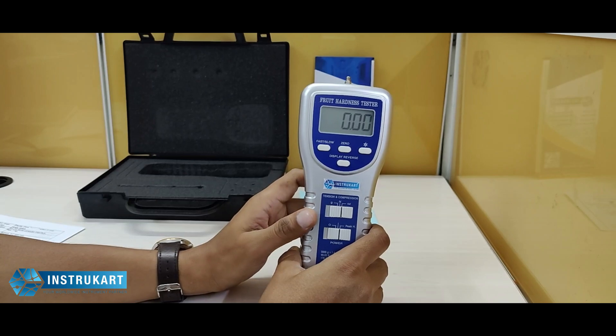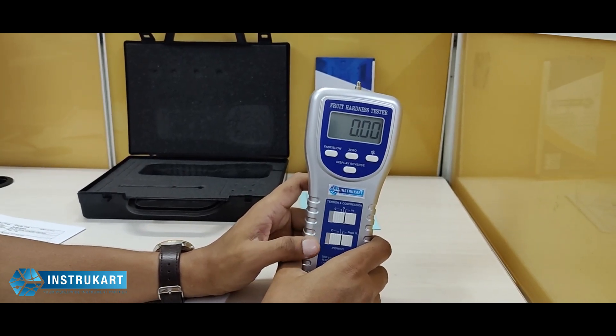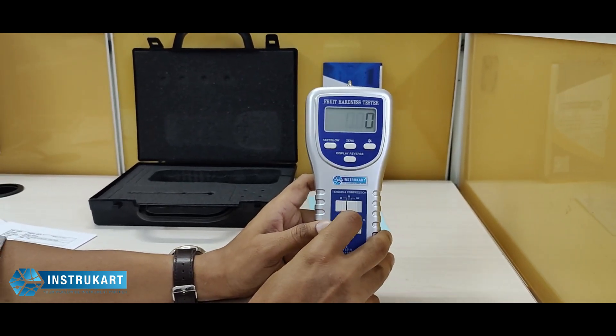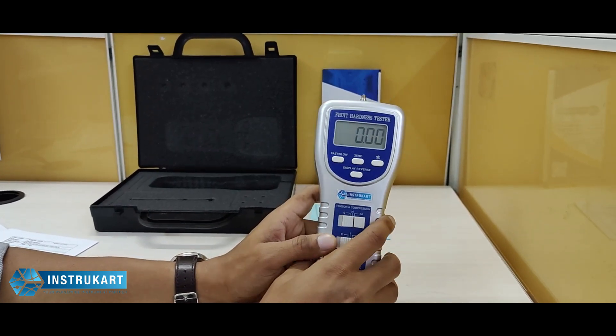It also has a peak hold function which will freeze the display at the peak value. Unit selection can be done between grams, Newton, or ounce.